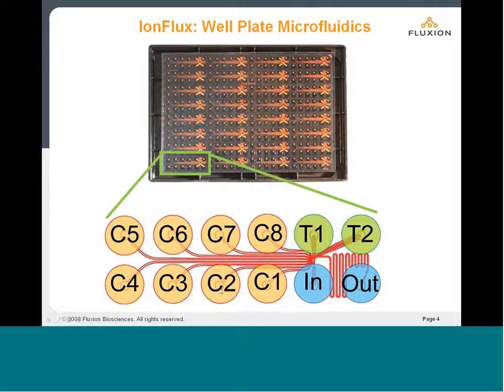And the timing of these can be varied and can be quite short. And then a washout period, once a compound is delivered, would start immediately upon stopping the compound delivery, due to the fact that the main flow channel is continuously flowing throughout the experiment.